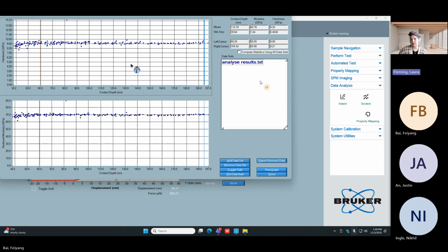I want us to have a conversation about it, because 99% of the time, and I really wish that was an exaggeration, the compliance, sorry, let me back up. Jim set the compliance when he was on site, and he set it well, based on this data, where there is no trend here. It's very nice and flat. If all of a sudden you're seeing a change in your compliance, it almost always is the sample or the sample mounting, meaning it's not being held to the magnet well enough, or a couple years have gone by and the epoxy that holds the sample to the AFM puck has gone brittle or something like that. And I want us to correct the root cause, not calibrate to an incorrect compliance.